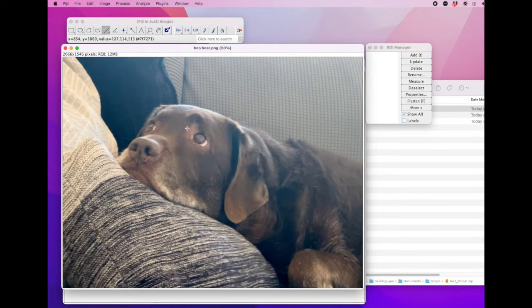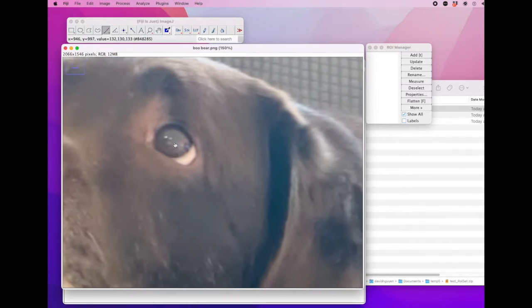So what we could do is let's zoom in, right? And we want to outline the shape of Lord Grantham's eyes. Okay, what I recommend is using one of these closed shape tools. That is, they form a closed loop, okay, with no open ends. I recommend the kidney bean tool, right? What is the kidney bean tool? Well, if I draw a half circle and release, it fills in, it closes the shape.